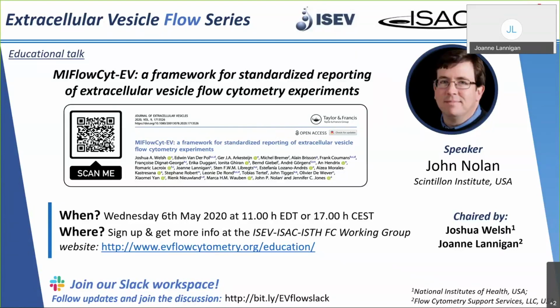And as part of this EV flow cytometry working group, a recent paper has been published as a position paper in the Journal of Extracellular Vesicles, which is the topic of our discussion today. And that topic is the framework for standardizing the reporting of extracellular vesicle flow cytometry experiments, otherwise known as MIFlowCyt-EV. So John, thank you very much for lending your time today and sharing this information with the audience.